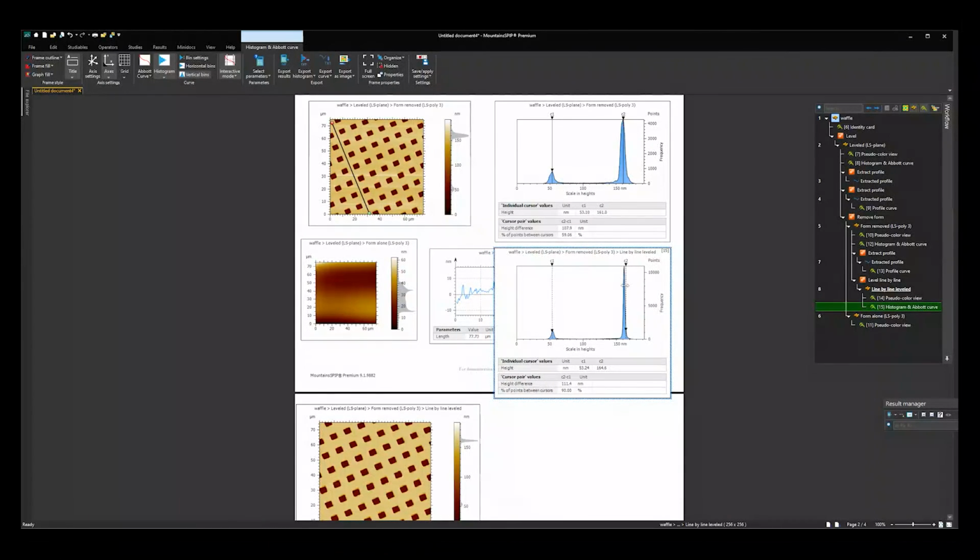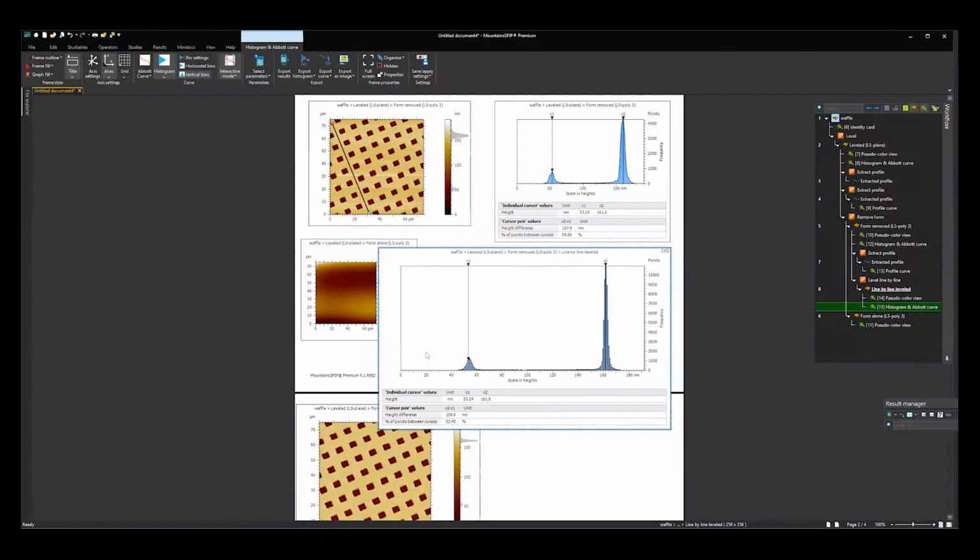And you can see now my peaks are much sharper, much better. Huge improvement over the plane fit. The flattening really did a huge improvement. And now I can probably make a more accurate measurement of the distance between these pits. So now 108. There was a 107.9 there as well, but here we have better clarity and better definition.